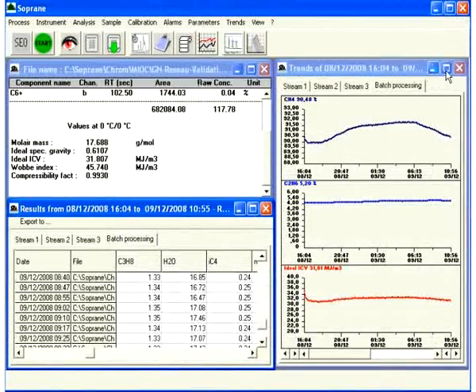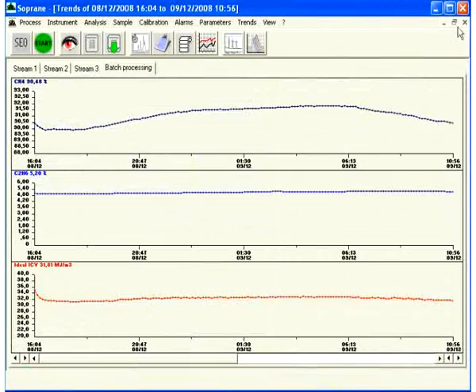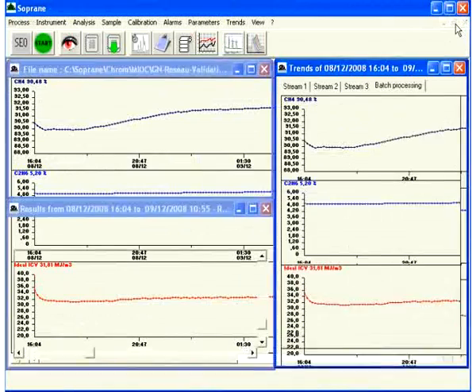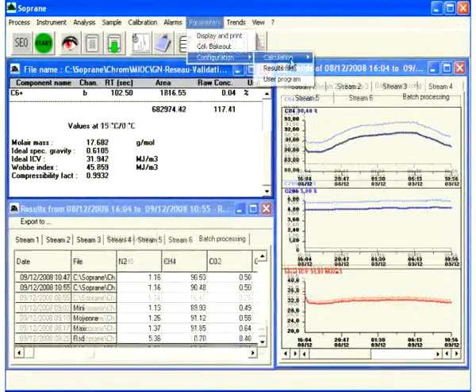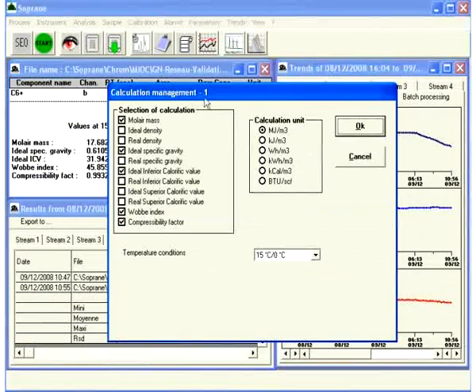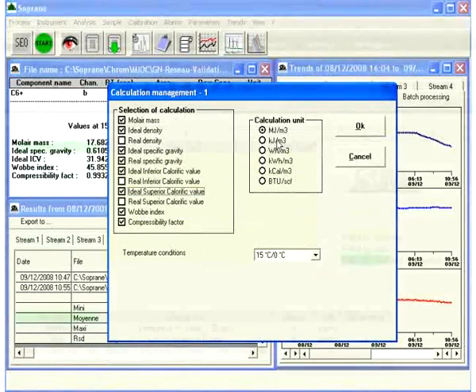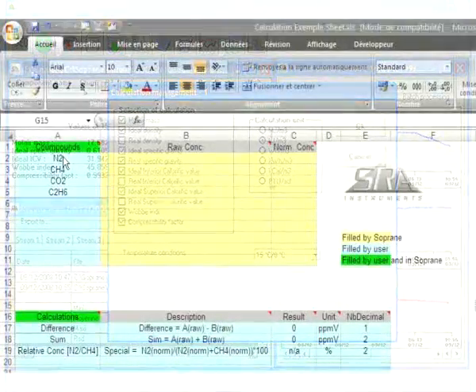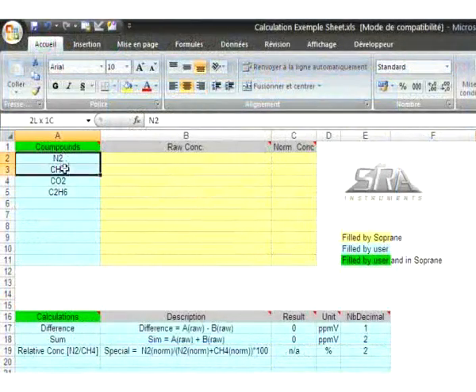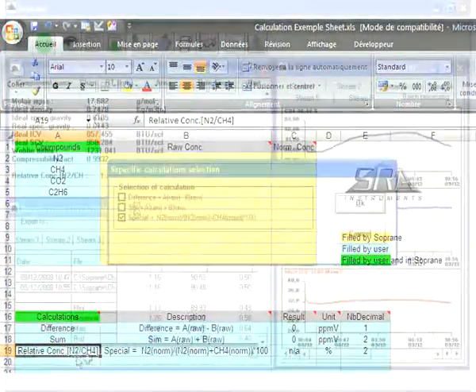Standard and specific calculations according to ISO 6976 BTU including standard calorific value, molar mass, density, etc. Your user specific spreadsheet calculation is also to be integrated automatically into the final report format.